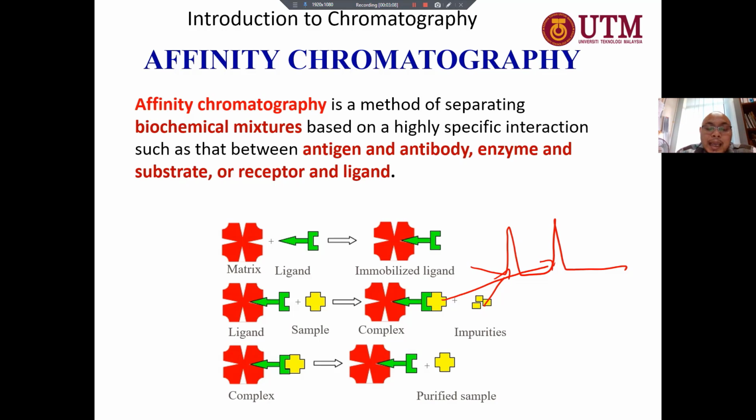For example, in adsorption, you said the interaction is with the active site. Polar analyte will interact the most with the polar active site. Meanwhile, the non-polar analyte will not interact as much with the polar active site, so the non-polar analyte will elute earlier. As long as you can show the understanding toward the interaction, I will give the mark accordingly. Don't worry about remembering everything as it is. You just need to write based on the understanding.